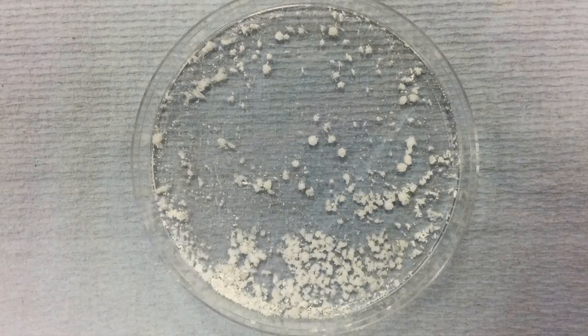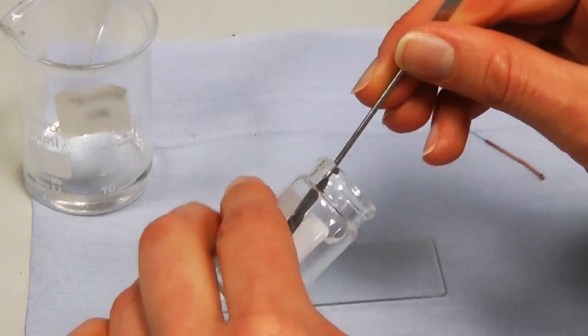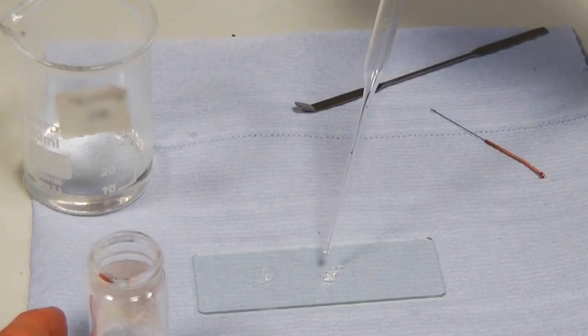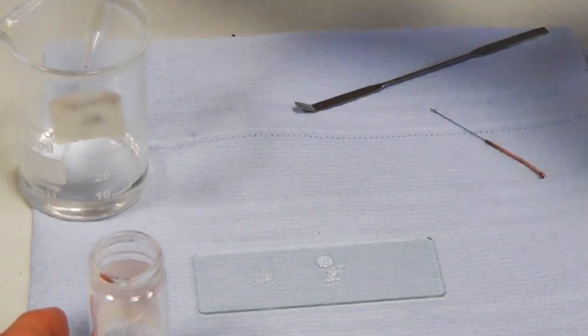First, you will need to grow a crystal of your sample to an adequate size for analysis. Once suitable crystals have been obtained, use a spatula to place a few on a glass slide. Place a drop of oil onto the crystals, as it will make it easier to manipulate them and select the best candidate.